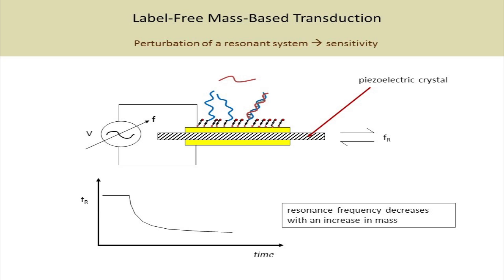Maybe you can guess what I'm going to tell you. So we look at the analyte here. If it's a nucleic acid, it's going to have lots and lots of negative charge because of the backbone phosphates. So what's going to happen when I bring this negative charge down to the surface through hybridization? What's going to happen to the electrons in the metal? What are they going to want to do?